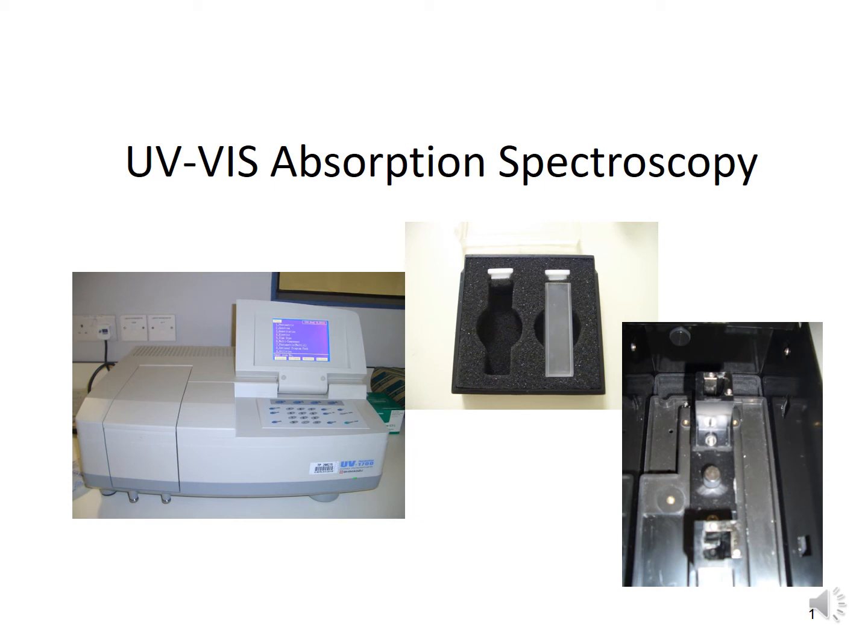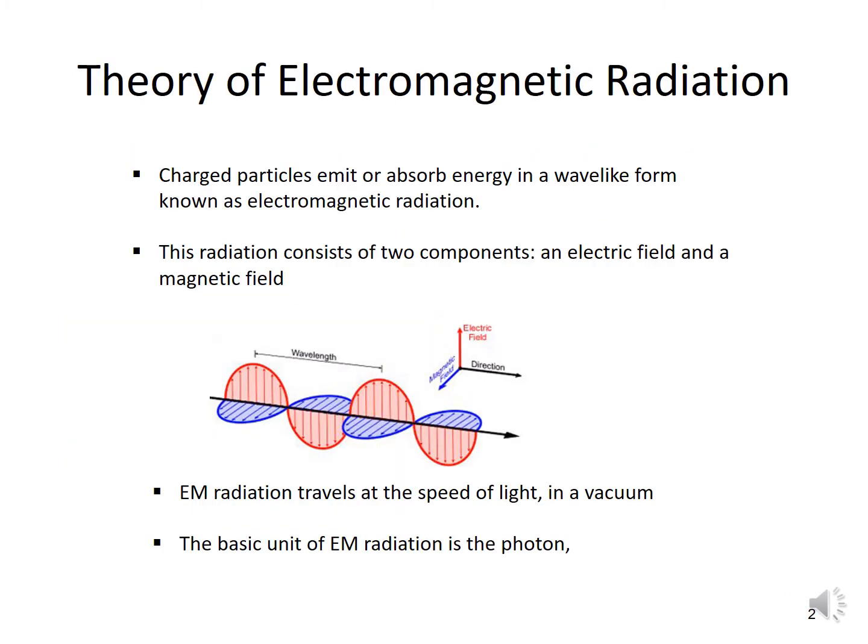Good day, everyone. So, today you're going to learn about ultraviolet visible spectroscopy. Before we go through the UV spectrophotometer, we're going to learn about the theory of electromagnetic radiation, which I have explained in detail in chapter 1. But this is just for recall.